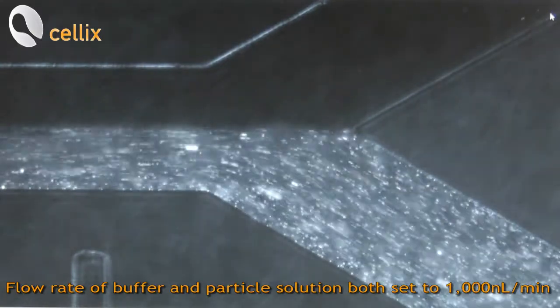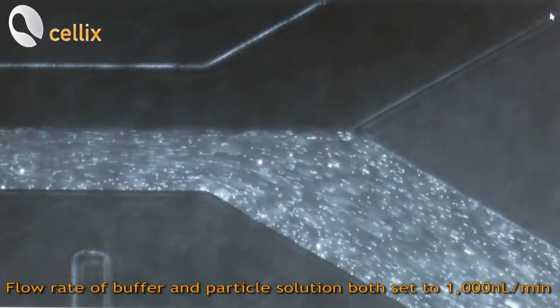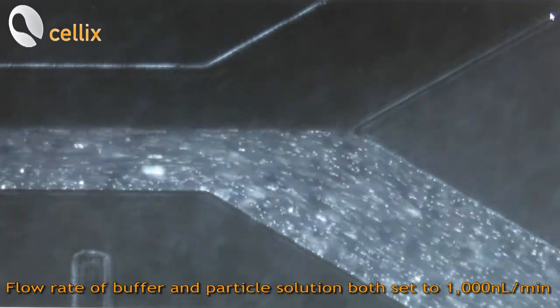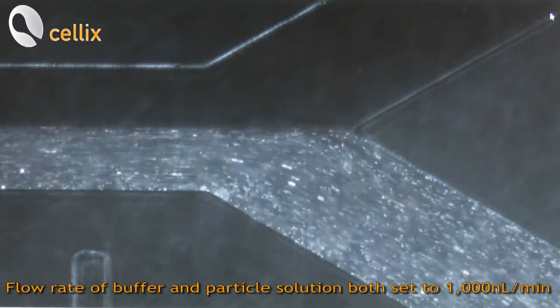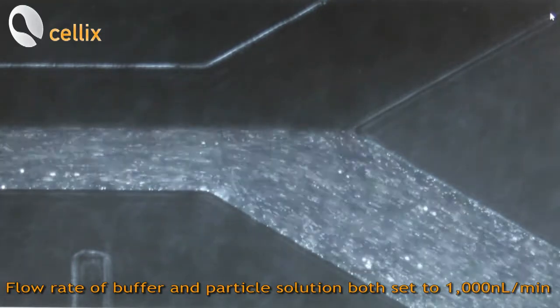As you can see here we have a stable interface. Of course the interface is actually in the middle of the channel as expected because we are running the same flow rate from the two inlets.